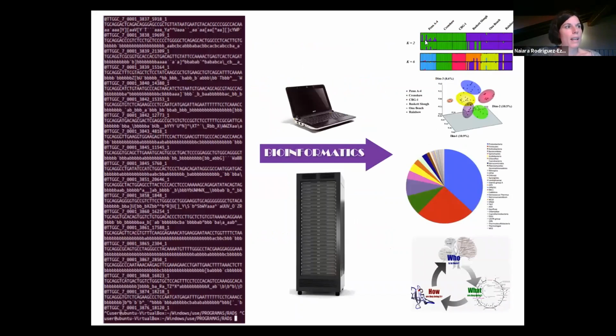So as I said, the type of files we will be receiving will look like this, and they are huge. And we want to do things so that we achieve analysis that will look like this, that we can interpret, we can understand. So to go from this to this, there's no way we can do it with a small laptop on a user interface with Windows or Mac or whatever.